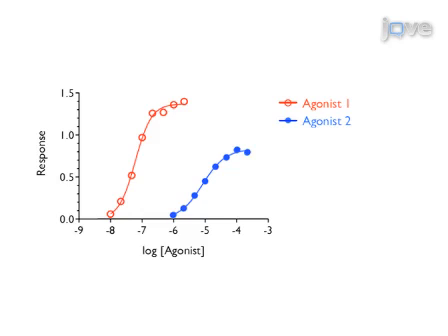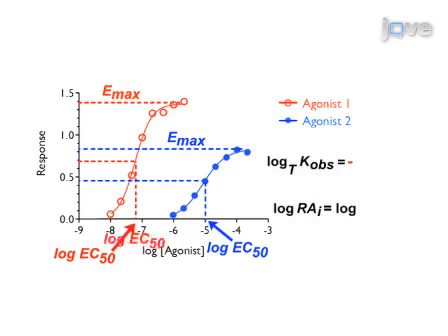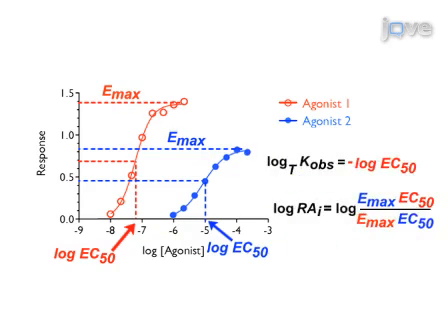The next step of the procedure is to estimate the Emax and EC50 values of the agonists using nonlinear regression analysis. These values are then used to calculate initial parameter estimates for the subsequent nonlinear regression analysis involving the operational model.